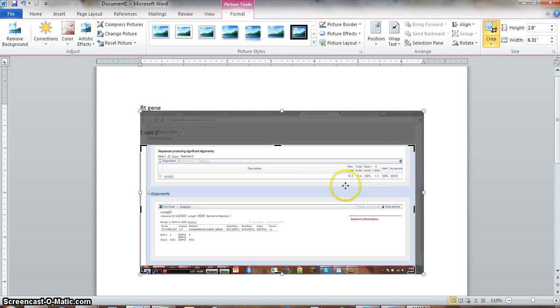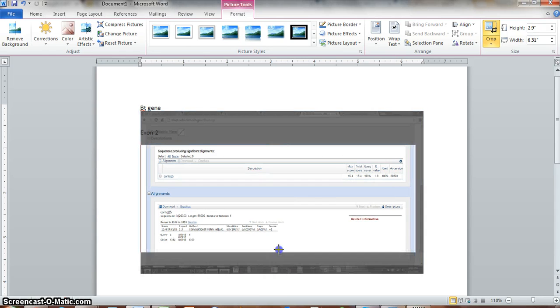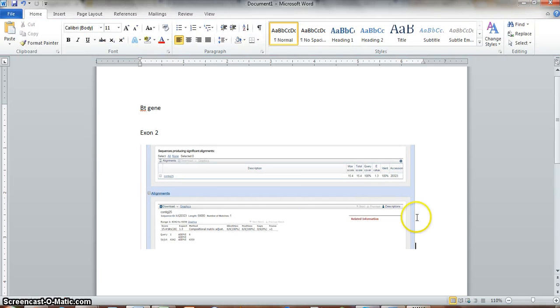So we can have this score, and we'll keep track of what everything looks like. And so that way, when you go back, and then when you're actually putting together your posters, you'll have some images that you've saved that can show problem areas. You're not going to want to show every single screenshot, but if there was an area that was contentious where it was really different from melanogaster, you'll want to actually say, this is why it doesn't quite land up here because of this. And so then you can put up a screenshot and actually see what it looks like.